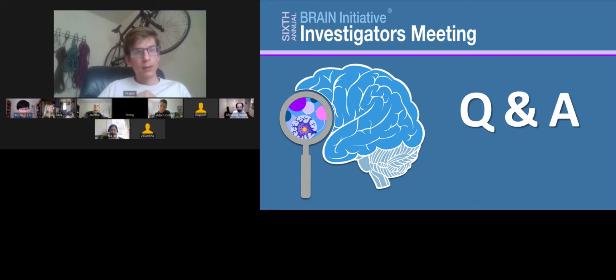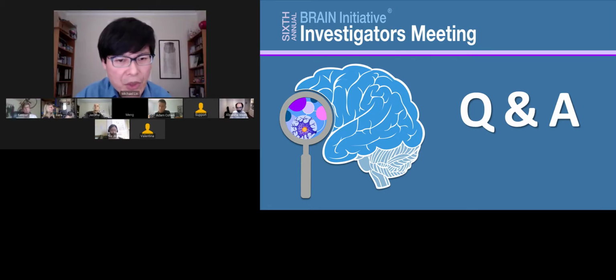And then there's one more question, which is from Jaida. Do you have an automated segmentation algorithm for dendritic ROIs? And have you compared the performance of GCaMP7b with iGluSnFR?